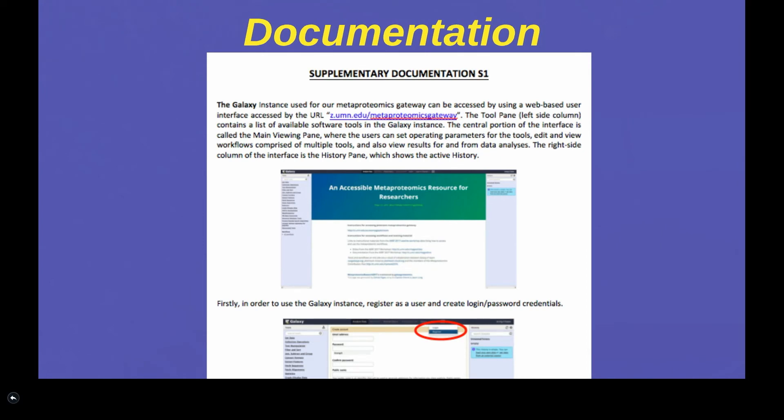This contains step-by-step instructions on how to run the analytical workflow on a test input dataset derived from a North Pacific Ocean sample.